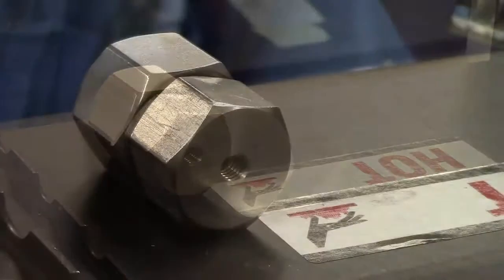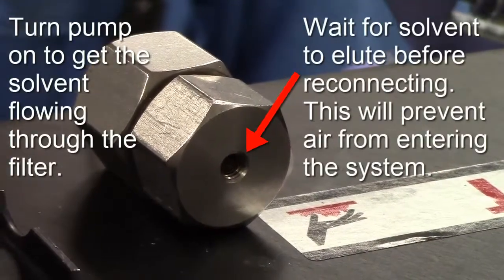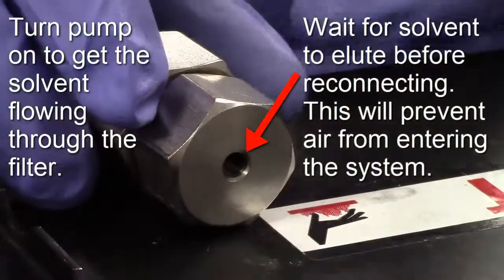Then, turn on the flow rate and wait for solvent to elute from the filter before connecting the outlet line. This will minimize the amount of air introduced into your system.